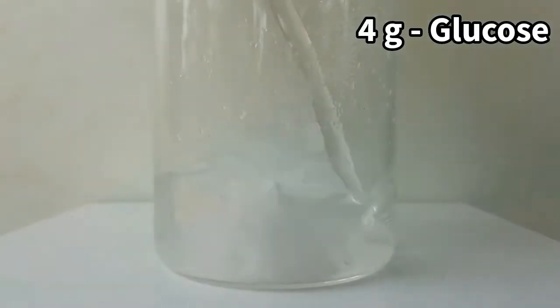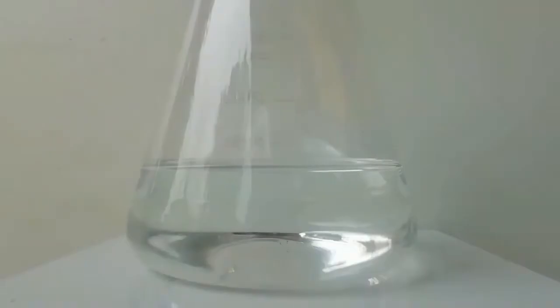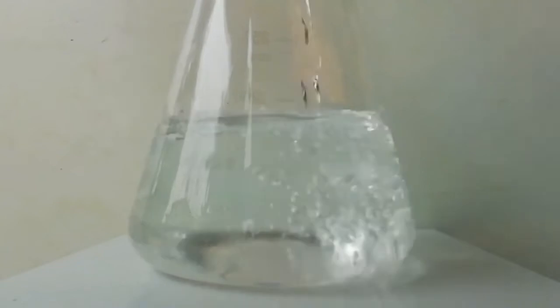Then 4 grams of glucose is dissolved in 100 milliliters of distilled water and mixed with the solution of sodium hydroxide.